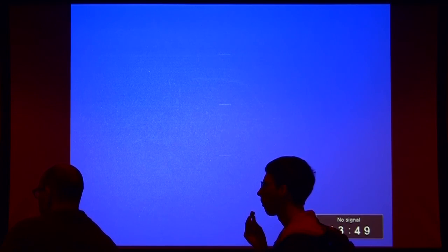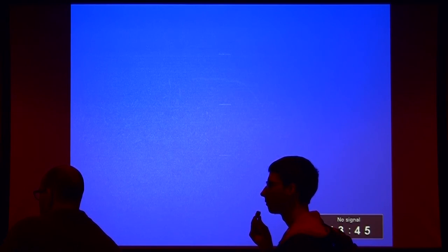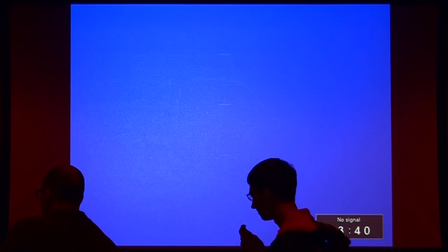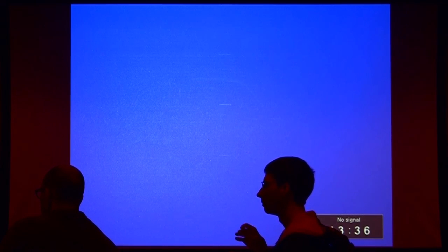I see. So like putting them very, very close to the electrode won't be enough. You have to have some kind of... Yeah, if you could electrophoretically move it out of the paper somehow, then maybe. I see. But if you're just expecting it to diffuse out of the paper, I think you're going to tremendously dilute it in the process. Okay. Even with a good solvent. Yeah. That's my guess. Yeah.